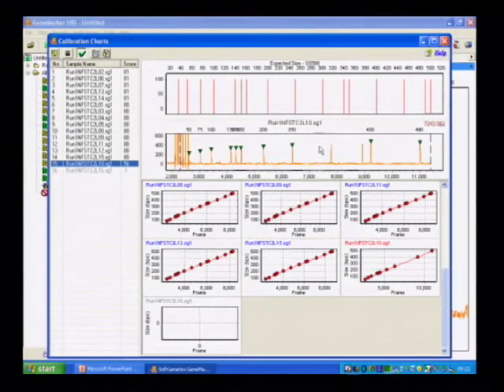Why? Is that just a size issue where the peaks aren't big enough to meet a threshold, or why would those not be assigned? I'm actually not sure why, mainly because this part of the software we purchase, and it's some algorithm that goes ahead and assigns and identifies peaks. You know, just by eye, these two peaks don't look any different than, say, this peak or this peak. The ones that are assigned are the correct values. Right, so it must have some thresholding or some rule that it's using that unassigns these.